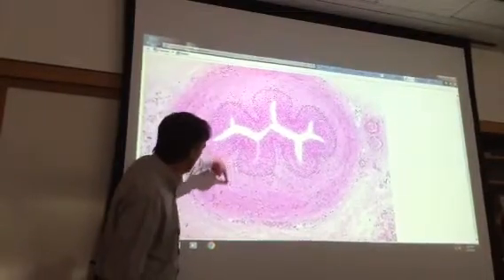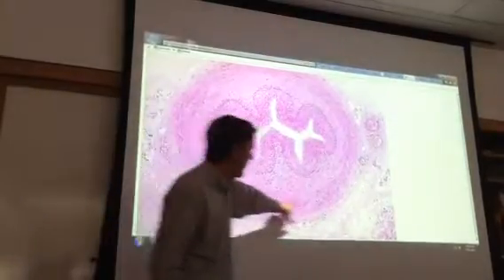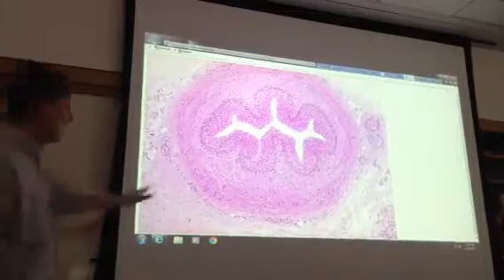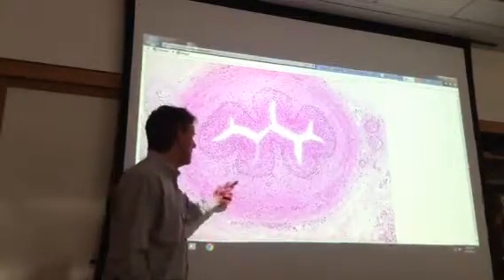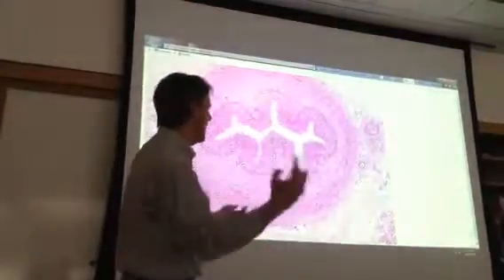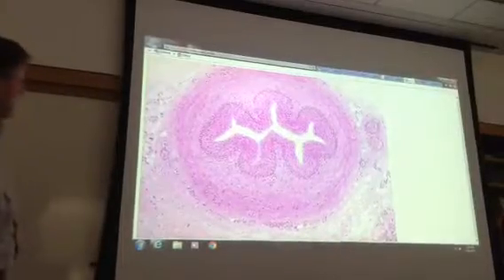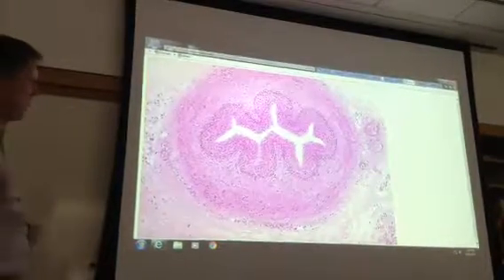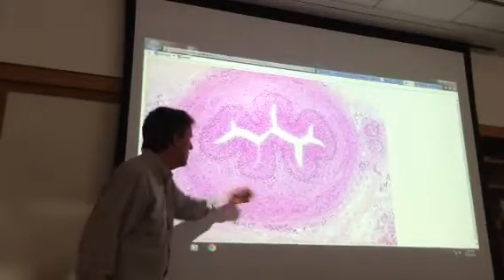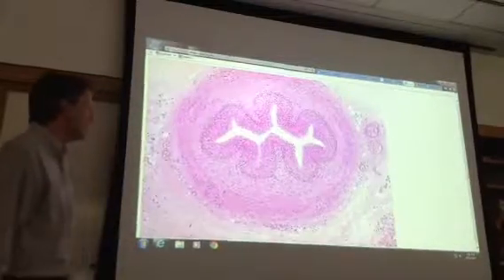Right below it, this area would be the lamina propria. These layers going around the outside, a little bit subtle, would be the smooth muscle layers. There's an inner longitudinal layer, so in a cut like this, you would expect to see the muscle fibers coming out towards you, and then there's an outer circular layer. Can I really tell the difference between the two on this slide? Not so well. I know relatively where the position should be: around in here should be the ones coming out towards you, and on the outside, it should be circular.